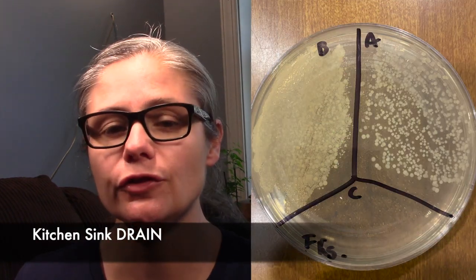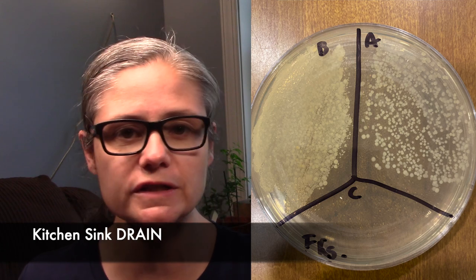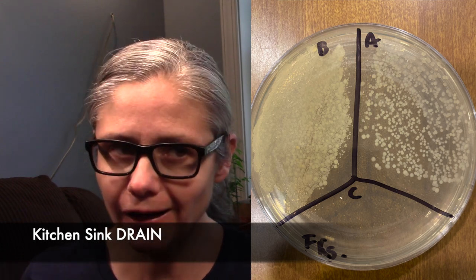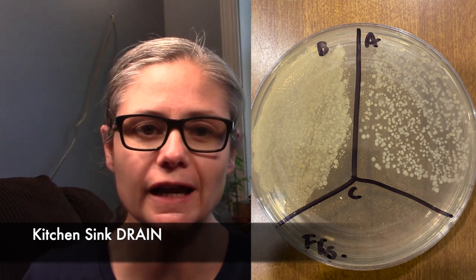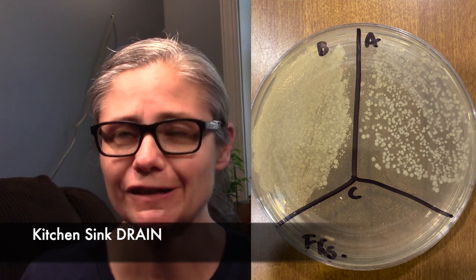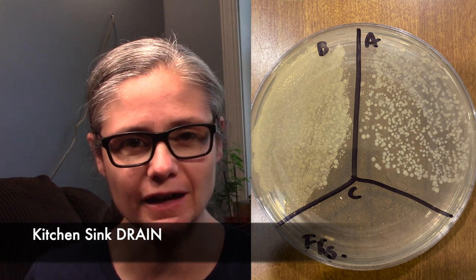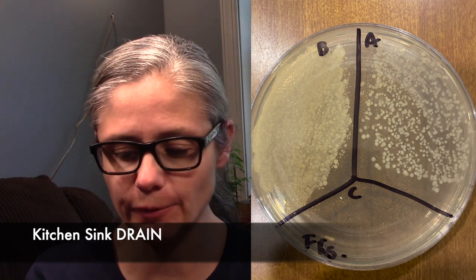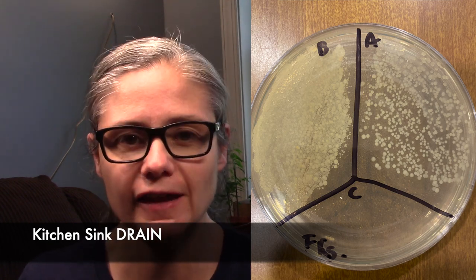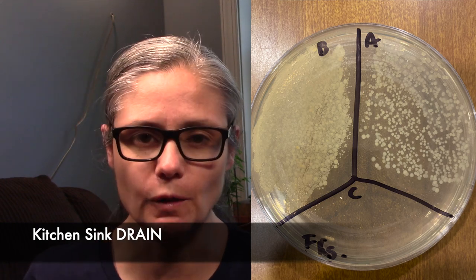Now the kitchen sink, the drain portion. If you watch my videos, you probably know I don't always test the kitchen drain because very few cleaners are able to actually remove all the bacteria in my kitchen drain. So I decided to give Fabuloso a try here just to see how well it does, and it performed as expected, right? In the before section, we can see a ton of bacteria. In the after, it was able to decrease it a little bit, not a huge amount, but a small amount. So Fabuloso does an okay job at disinfecting my kitchen drain.